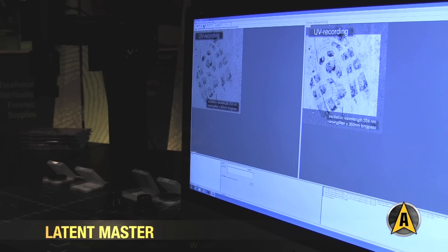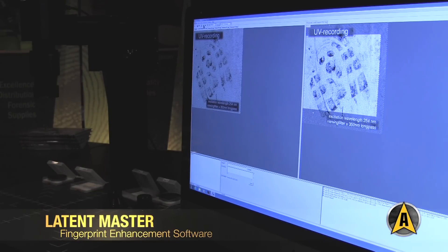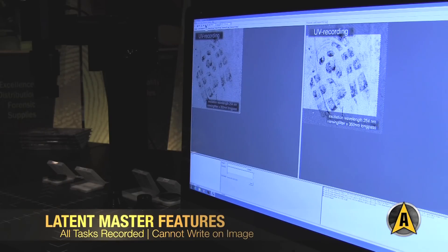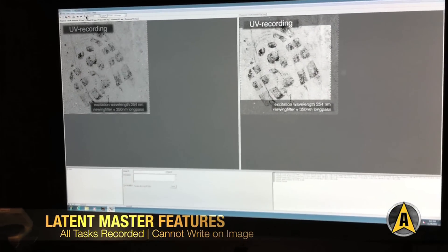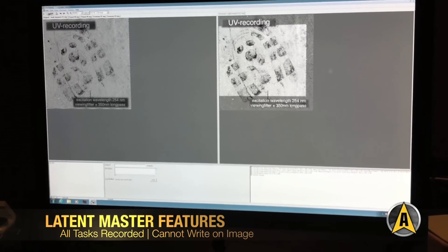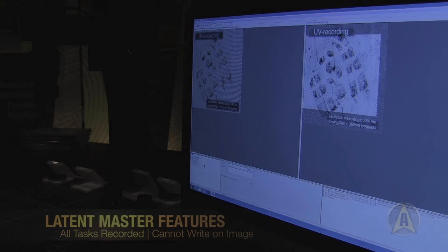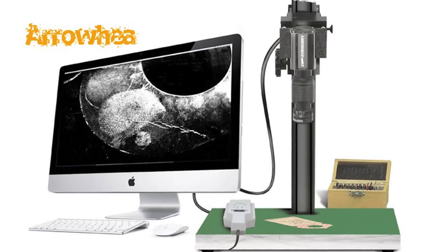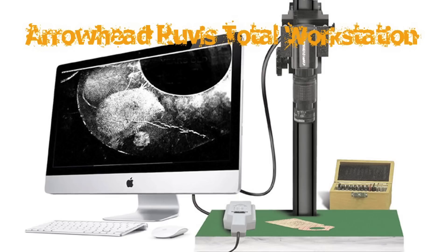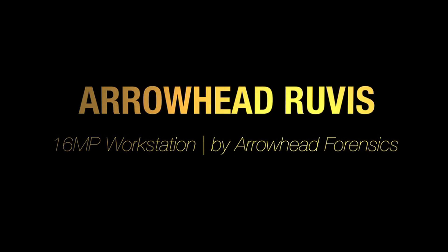One of the advantages of the latent master — and I was the first software to do this — is everything you do is recorded and can be played back and repeated. Everything that you do is in a list. You cannot write it in the image; you can't change an image to convict a particular suspect. It's not possible. You can use the coordinates in this object and see the pattern going down.